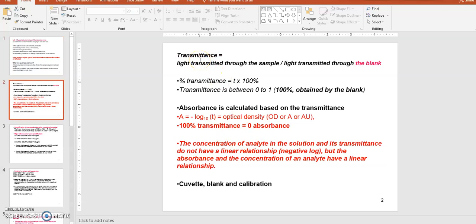The amount of light that's transmitted through your liquid sample equals the light transmitted through the sample divided by the light transmitted through the blank. What it means is you will have to have some kind of control standard that doesn't have any of your sample. We call it a blank cuvette. A blank cuvette is normally made with the solvent that dissolves your sample, but it's the solvent only. Since the blank cuvette doesn't have any of your sample, it's going to have just the background transmittance only, right? So the only true transmittance will be your sample that's dissolved in the solvent.